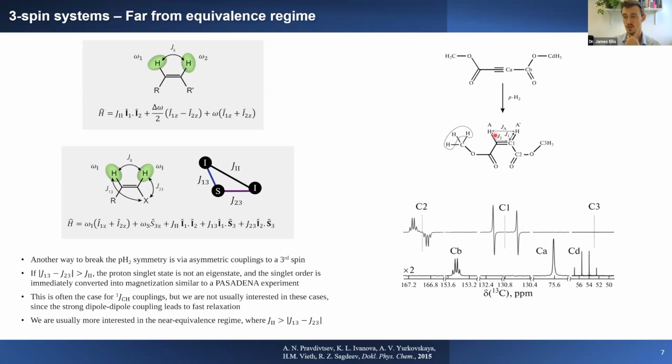Okay, so the protons are almost chemically equivalent, except for a small isotope shift. They have almost identical chemical shift, but they have a very large difference in J coupling to this carbon-13. And that large difference in J coupling acts in a similar way. That also strongly breaks the equivalence between the hydrogens. And so you see this characteristic up, down line pattern.